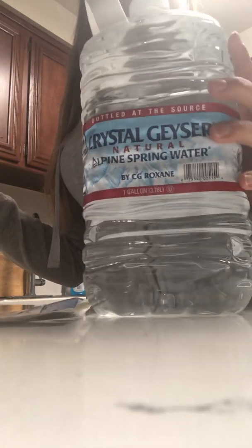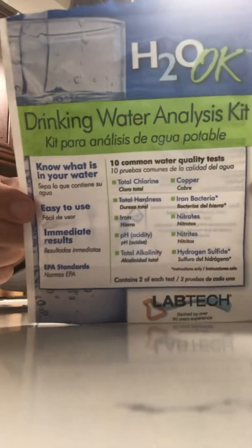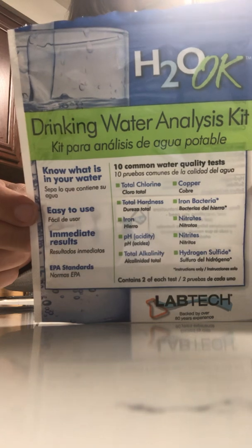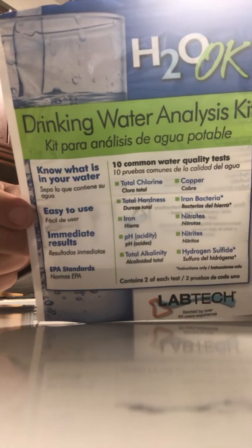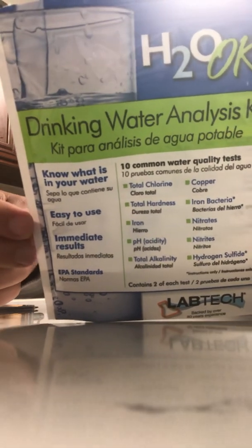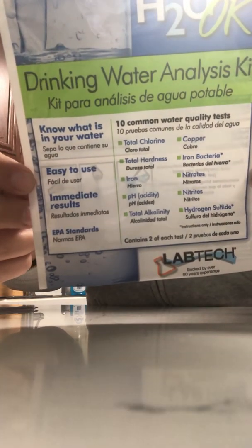You can get a big old gallon of it. So here's what we're going to do. We're going to use this test that I bought from Home Depot today. It has a chlorine test, hardness, iron, pH, an alkalinity test, a copper test, an iron or bacteria test, a nitrates test, and a hydrogen sulfide test.